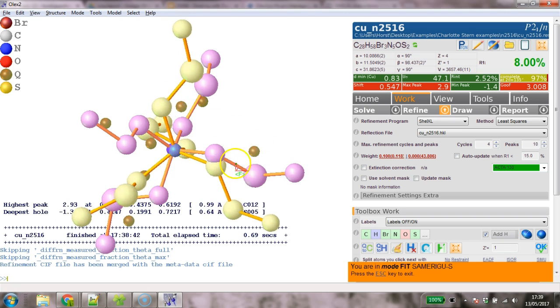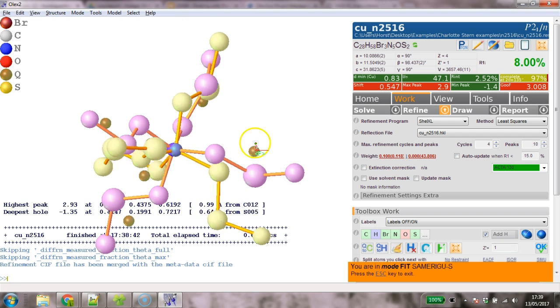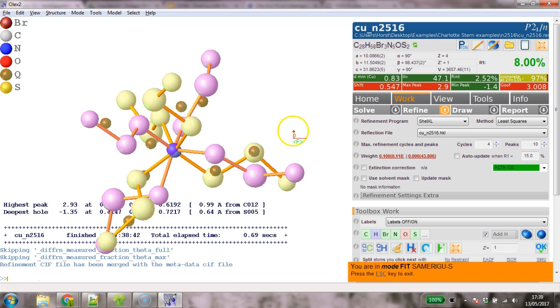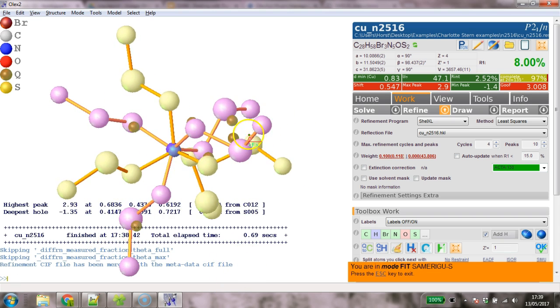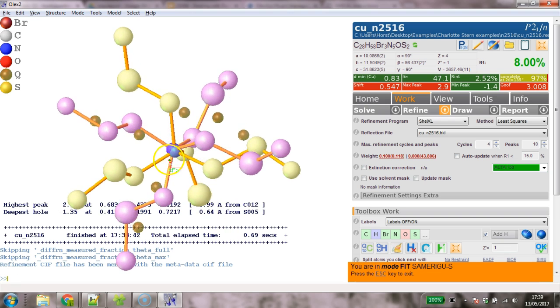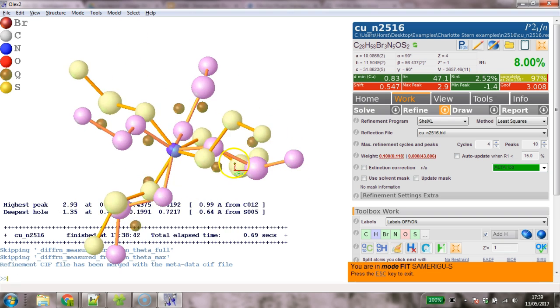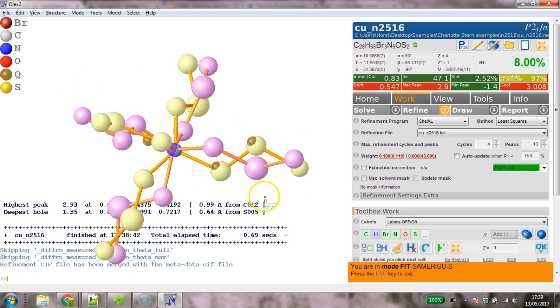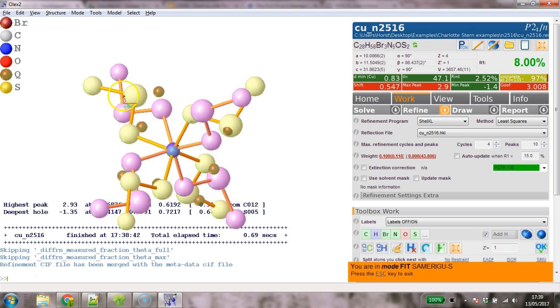Okay, so Control Q to switch those peaks on again, and now with just the left mouse I can rotate this around and see whether I can find a position where these atoms overlay those Q peaks. So I'm aiming for this one here. As you can maybe see, it's not so simple to do. It's not so hard. It takes a bit of practice to twiddle this, but it's not so bad. So these two are overlapping. These ones look quite good. So everything looks quite good. So you can see this doesn't really overlay. There's no reason why it should. Obviously the arms can wave about, but that's good enough for the moment.